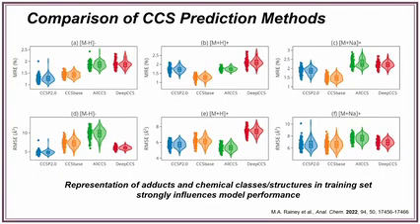Now there's going to be a bit of variability amongst these different prediction algorithms. I think for the most part they do decently well, and they're a great resource because you can't reasonably go out and buy a standard of everything and find someone with a drift tube to run it for you to check experimentally.